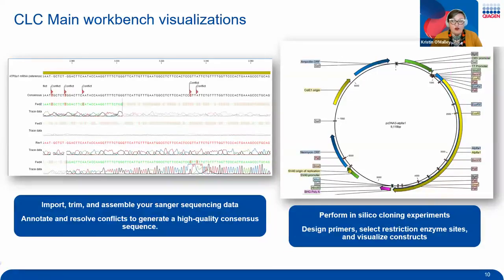So I am going to launch a quick poll right now just to check in with you guys to make sure that these are indeed some of the visualizations that you would like to see generated today. And if there are some visualizations that I didn't cover, feel free to add those into the Q&A box or into the chat box. And if we have some time at the end or perhaps during our Q&A breaks, we can cover those as well.